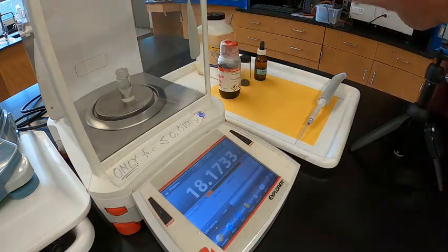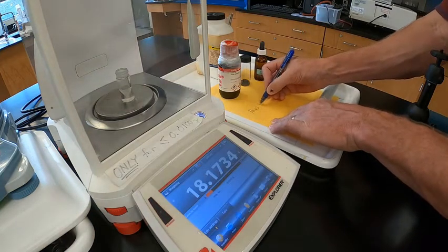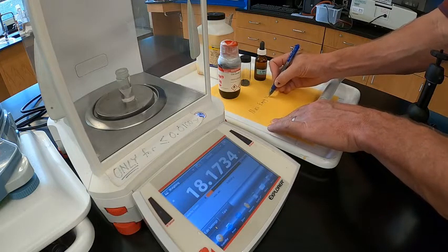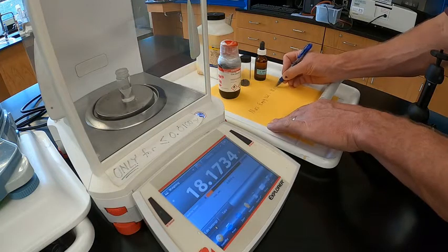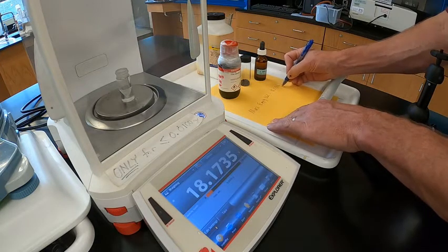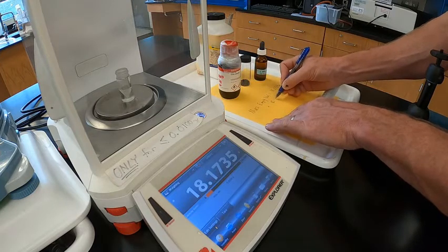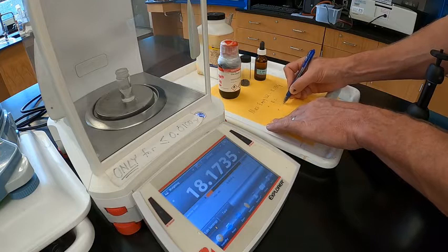The mass of the empty vial is 18.1734 grams. Now we're going to add the boiling chip, and then we'll add the salicylic acid.